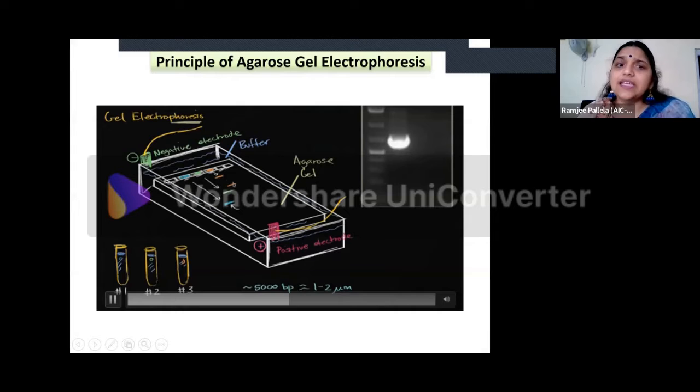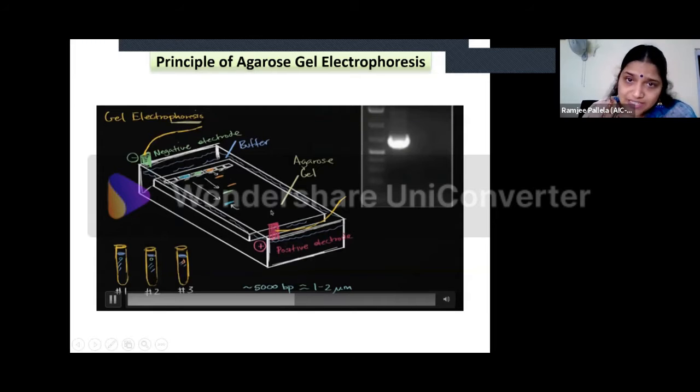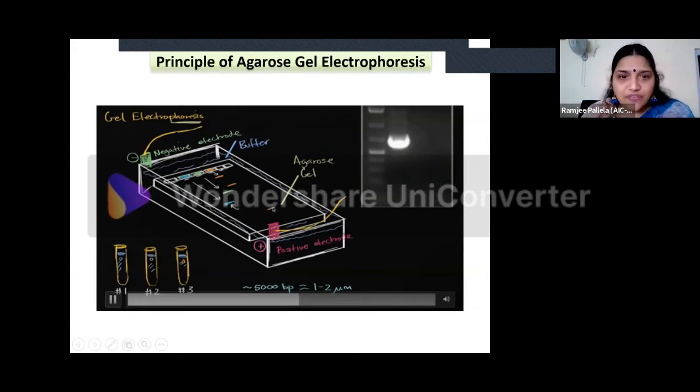Just in case it is not amplified at all. For example, your genomic DNA was there and it didn't get amplified because you forgot to add the primers to it, for example. Okay, then what will happen? It will be stuck here in the gel well itself. It will not run any further because it is a very heavy molecule. It's the genomic DNA, right? The complete genomic DNA. So it will not run. Otherwise, if it is smaller, then it will come here.